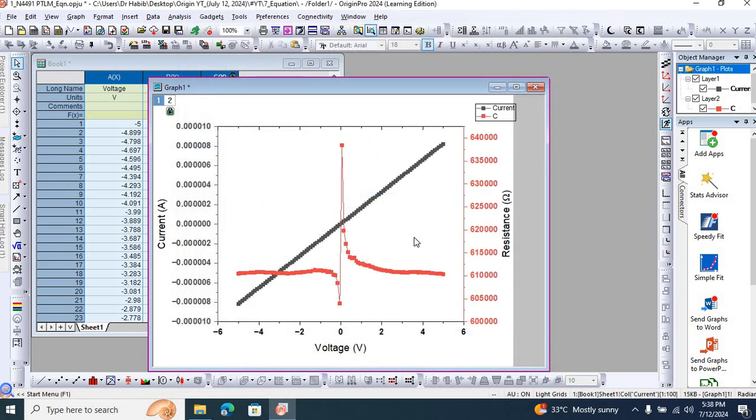In order to make this figure more obvious, let me set the color of everything which is related to the left axis as blue, and everything that is related to the right axis as red. So I'm gonna set the color of this label to red as well.